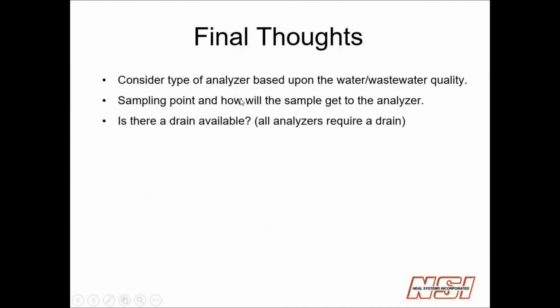Is there a drain available? All of these analyzers require a drain. You have to have water, obviously, feeding into the unit, but then that's got to go somewhere once it passes across the cell. So be sure you have a drain available to take that. We did have an installation at a remote pump well site where they didn't have a drain. So they wanted to drain it back into the well. And since the probe analyzer has no reagent, the thought was that that's fine, but that's not fine.